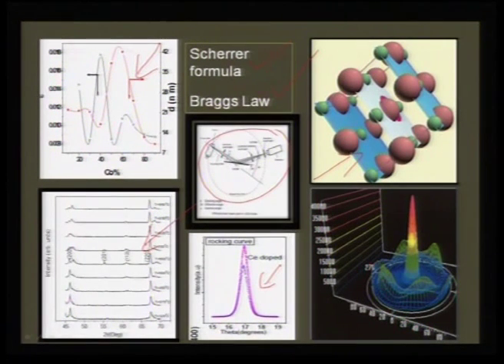So in the next few lectures we will also look at the applications of this X-ray in perspective with other case studies, and not only that, we will be looking at other spectroscopic tools in this particular module.